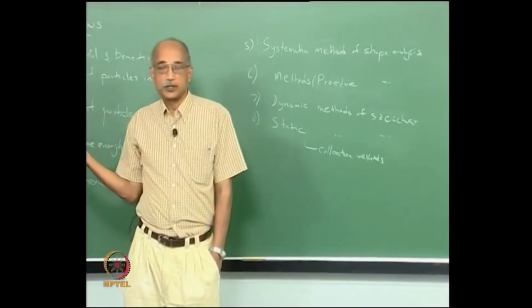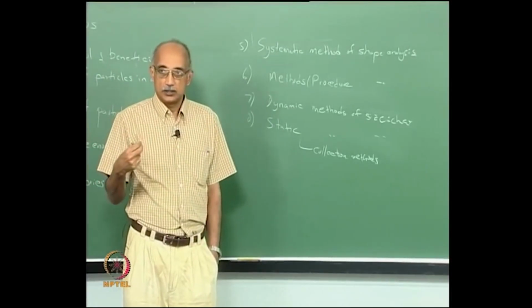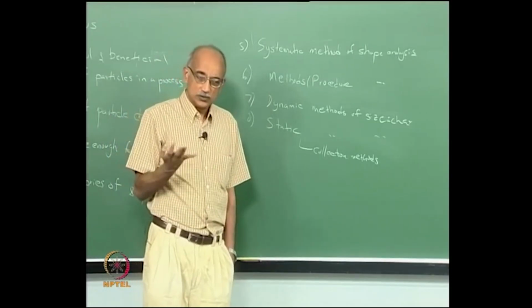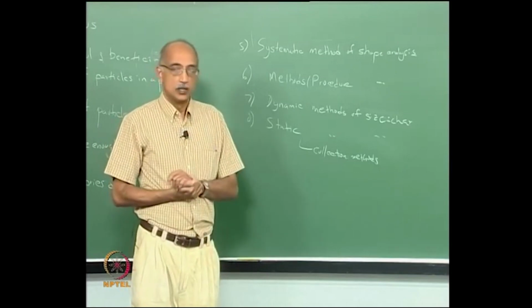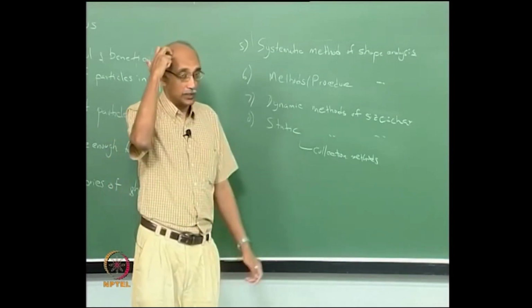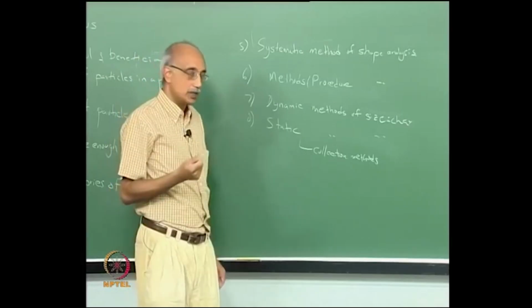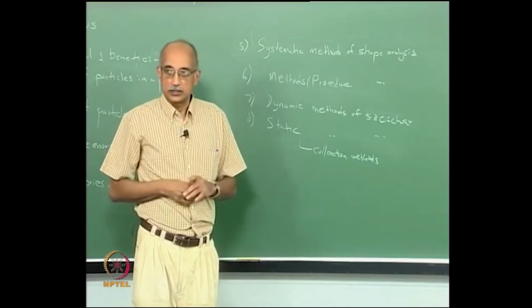Of course, this optical tweezer method that we talked about today is another example of a collection method which makes available a sample of particles for you to analyze. So again, it's important to understand the role that these methods of collecting particles play. Without that, you really cannot proceed to the next step, which is the actual methods of analysis.